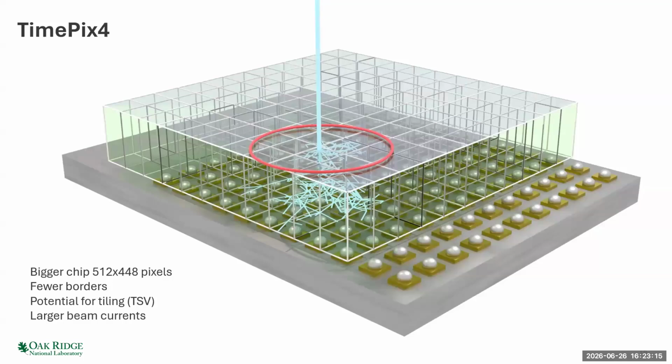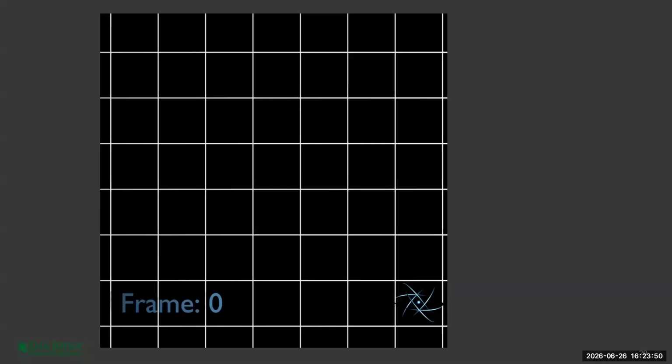But one of the terms I've used is events. And there's an important distinction here between events and electrons. So in all of these direct detectors, what you find is you have your very fast, high energy electron coming. So that's that blue line coming from the top there. And in this sort of cartoon, you can see that this fast electron is scattered about and it hits several pixels and it deposits its energy as charge into several different pixels, which are then read out by the electronics and time-stamped. And it's kind of interesting because you can see this for a single electron here.